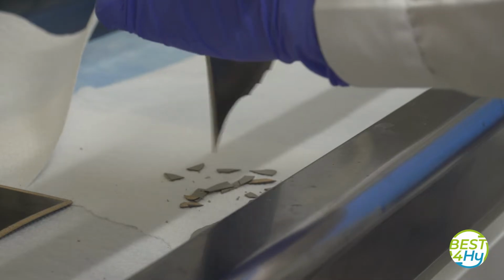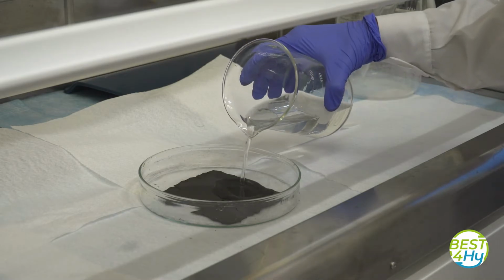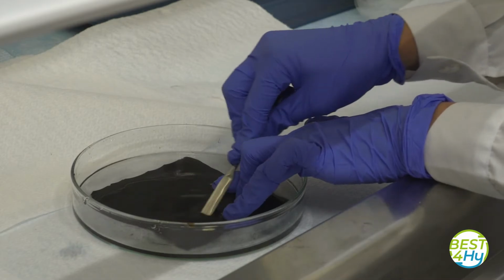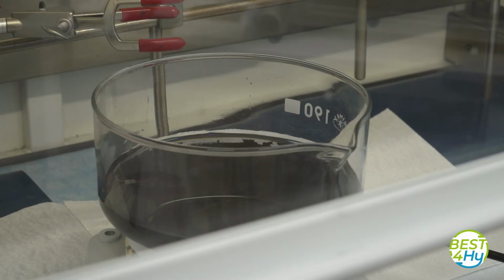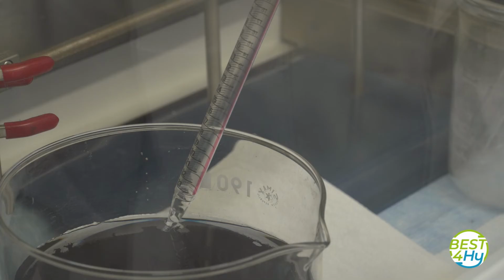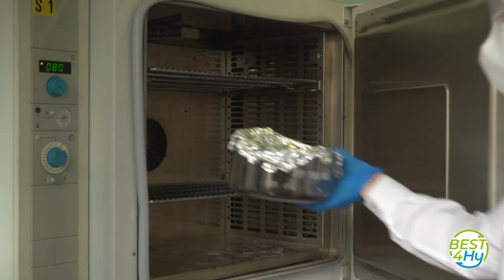At first, after the removal of the sealant, the end-of-life cell is immersed in distilled water to scratch the cathode by means of a metallic spatula and recover the lanthanum and cobalt-rich perovskite in the form of powder. The excess liquid is removed and the powders are dried in an oven overnight.